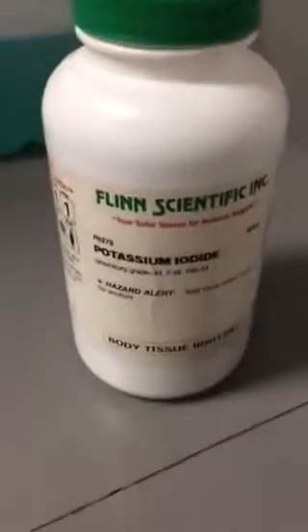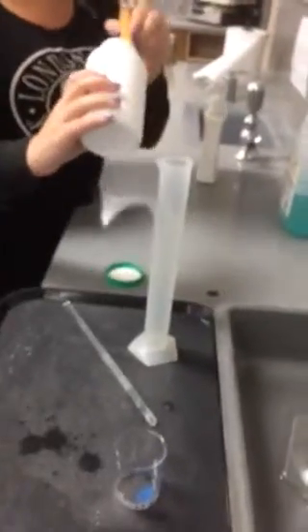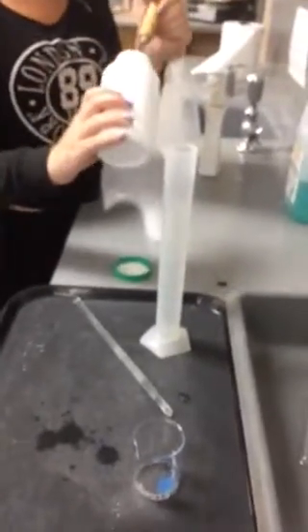It's just from pouring bubble solution into water. All right, and if we take this and stir it a little bit, it looks like there's bubbles in the water, but we're not really making much. When we start making bubbles, you're going to see a huge difference. So we got hydrogen peroxide and bubble solution. Now, the stuff called potassium iodide, which we're going to be pouring in there, we're going to take a little scoopula and get a nice scoop of that stuff and put it in. And you're all going to want to watch this real carefully, because this is just so cool.